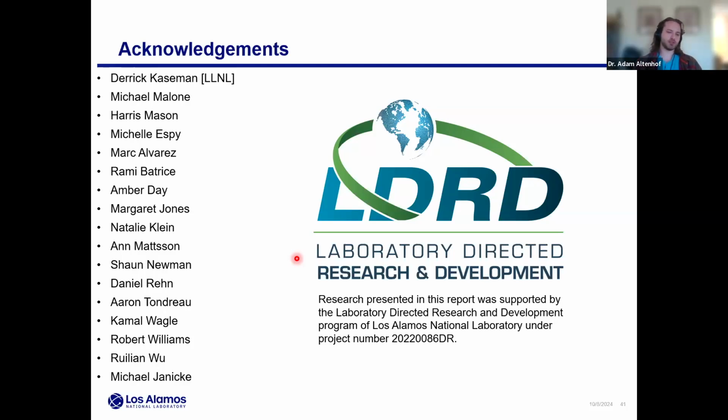If you have high resolution, you're going to measure for 10, 20 seconds. So even though I'm not taking that many scans, maybe 1,000, 2,000 scans, really just trying to capture all that resolution is taking a lot of time. So there are tricks you can maybe play there to speed up your acquisition time.